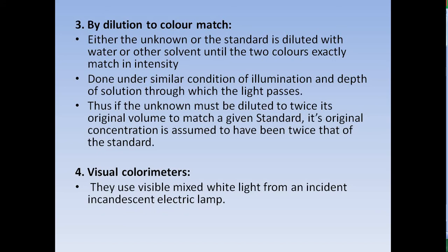Now next is by dilution to color match. Either the unknown or the standard is diluted with water or other solvents until the two colors exactly match in intensity. It is done under similar conditions of illumination or lighting, and the depth of the solution through which the light passes should also be the same.